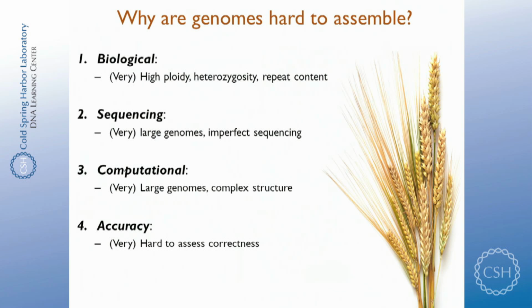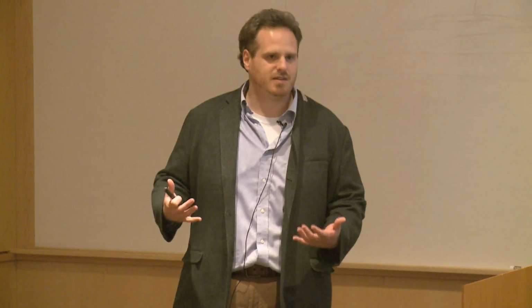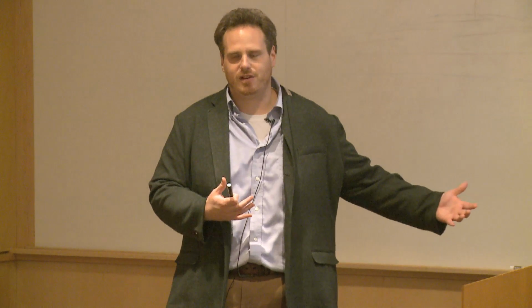If this is what you're working on, I encourage you to check out the Assemblathon papers. This was an international effort to take a data set, get all the leading assembly groups around the world to assemble the same data set, and then ask the question, how do they relate to each other? I think a major outcome from that is there's no perfect assembler, and the corollary is that it's very complicated to assess a de novo assembly to say if it's correct or not, unless it's from simulation.